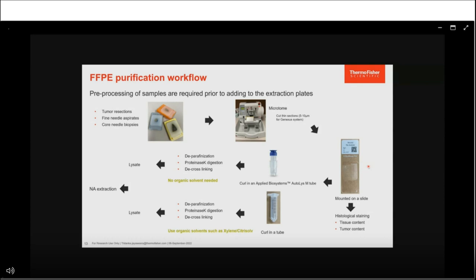The AutoLys-M tubes do not require any organic solvents — important since some countries are already restricting use of harsh organic solvents for processing FFPE samples. The tube has two parts: outer and inner tube. The sample curls are added to the inner tube with proteinase K solution and incubated at 60°C for one hour for deparaffinization and proteinase K digestion simultaneously. Then the tube is placed at 90°C for one hour for decrosslinking. The inner tube is lifted halfway and centrifuged to separate the lysate from the paraffin — the lysate passes through a filter to the outer tube while paraffin stays with the filter. Additional items needed include the AutoLys tube rack, tube locking lid, and tube lifter.